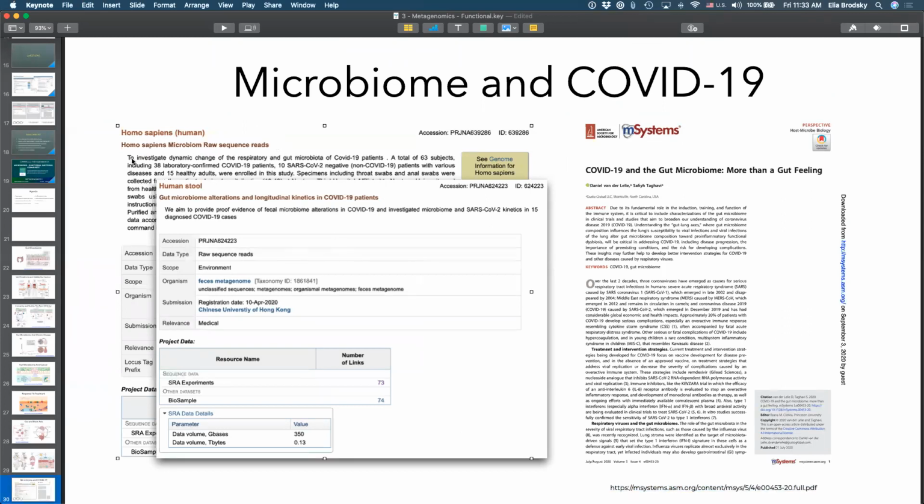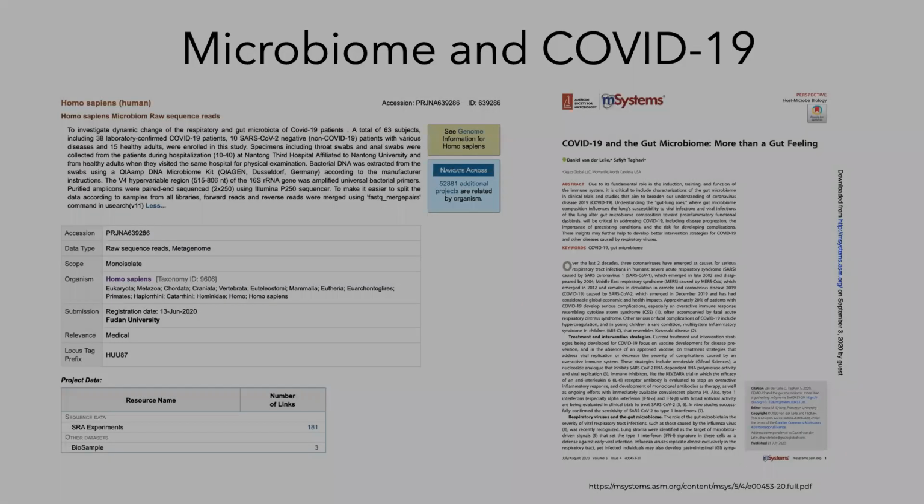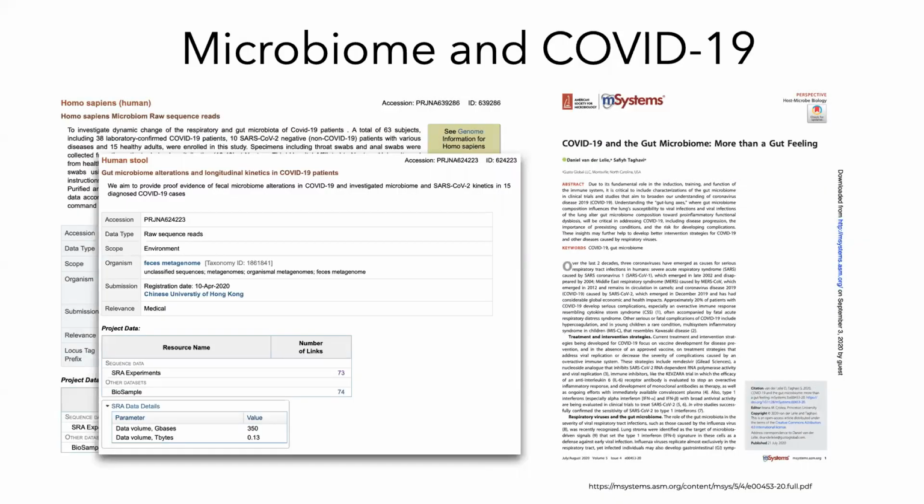And we went through how to download this data and how to load it up to create a pipeline, okay? Now, I think that we are now ready with getting set up with some of the basics to talk about some of the more advanced analysis that we can do when we want to compare groups of samples.